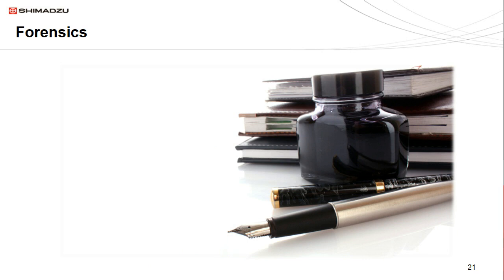PY-GC/MS in forensics? Really? Well, what we'll see here is there's actually quite a few applications that work with PY-GC/MS and actually have some pretty important significance as well. Whether it's a crime lab or arson or gunshot residue, we see that forensics often relies on PY-GC/MS for certain types of analyses. Let's take a look.